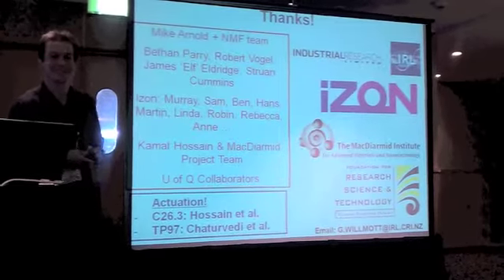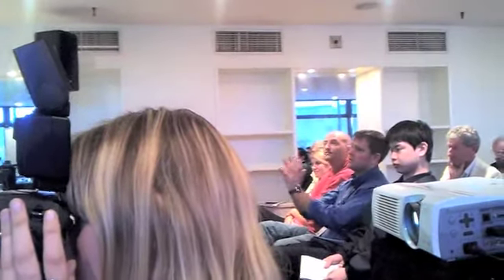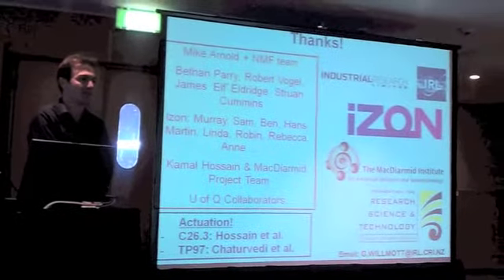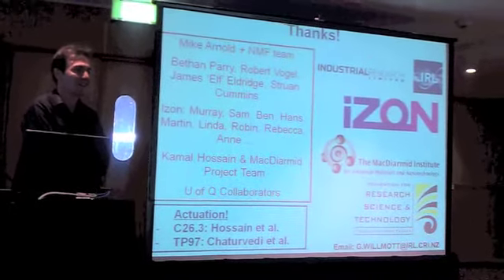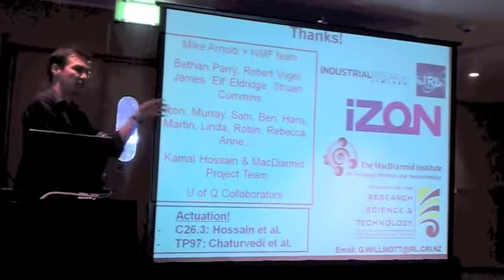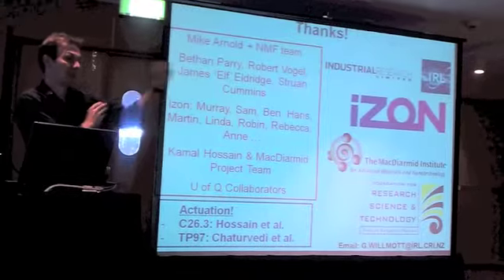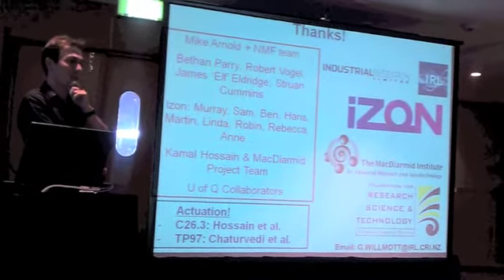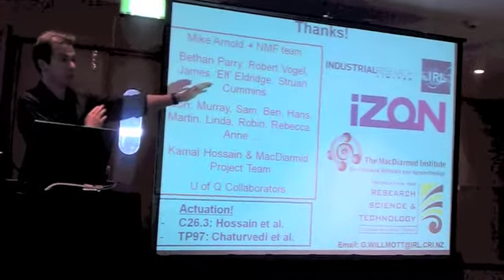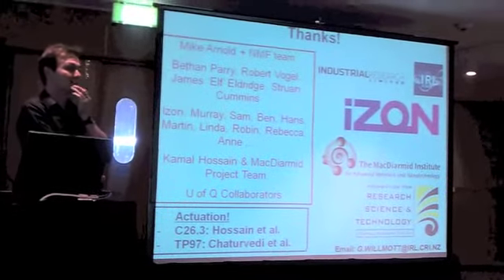No, fine. Ben? Have you seen any evidence of the model falling apart with particles that are very large relative to the pore size? Do you have any practical examples of that? No, I don't. It's something that doesn't seem to hold, actually. We haven't been able to illustrate it when you put a very large particle in. Generally, if it goes through the hole, it tends to give you the correct size, is what we've seen. Does it stay linear? Yes, stays linear. Okay.